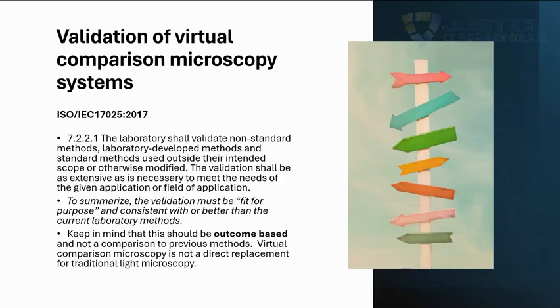So to summarize, in other words, the validation must be fit for purpose and consistent with or better than the current laboratory methods. However, let's keep in mind that this should be outcome-based and it's not a direct comparison to other previous methods. So VCM is not a direct replacement for the traditional light microscope, but rather additive.